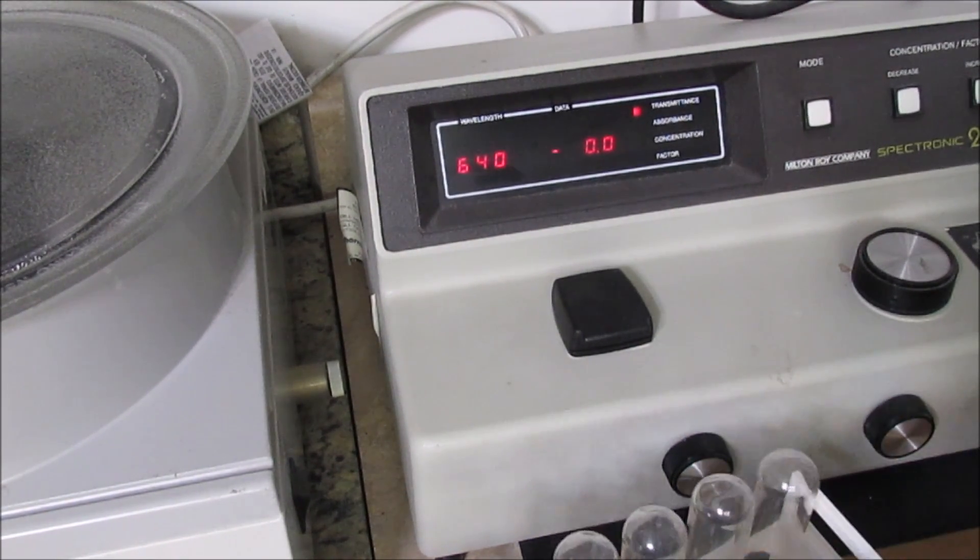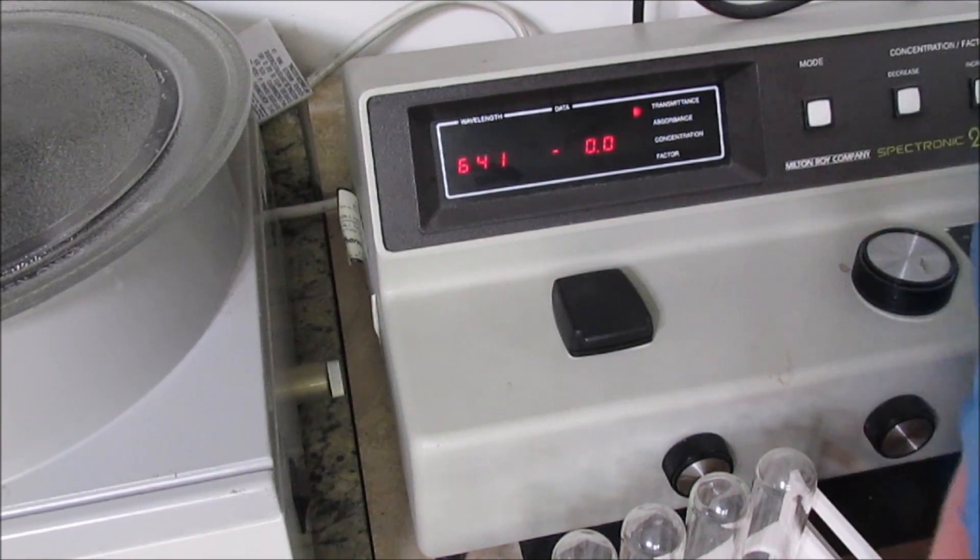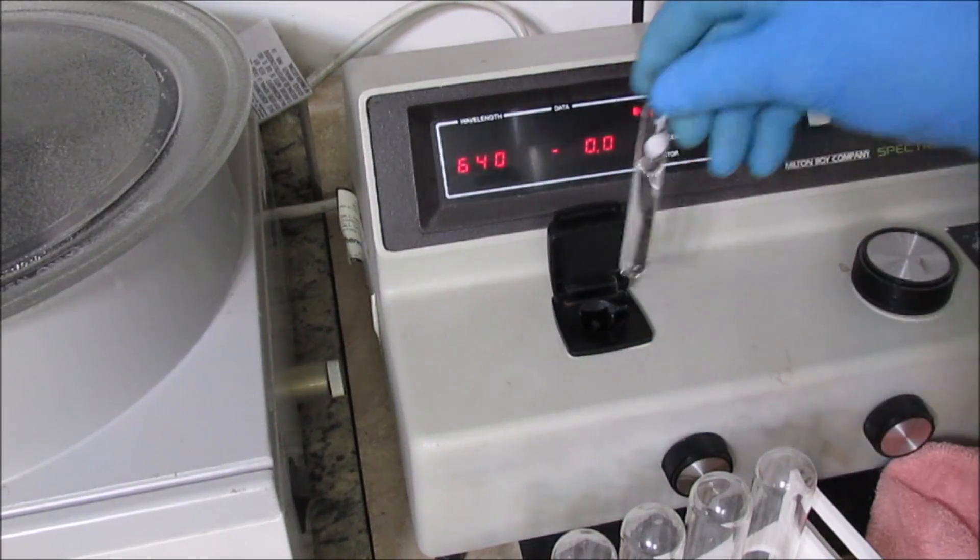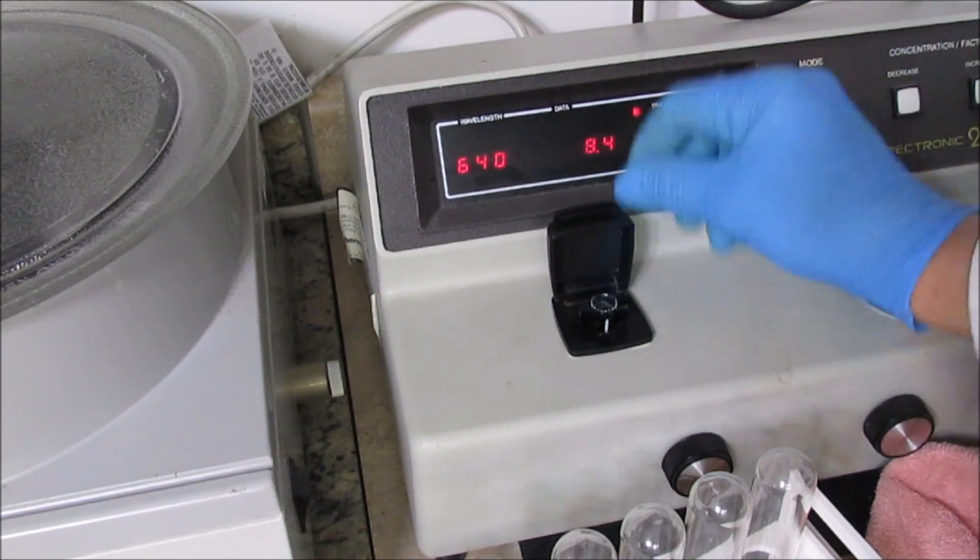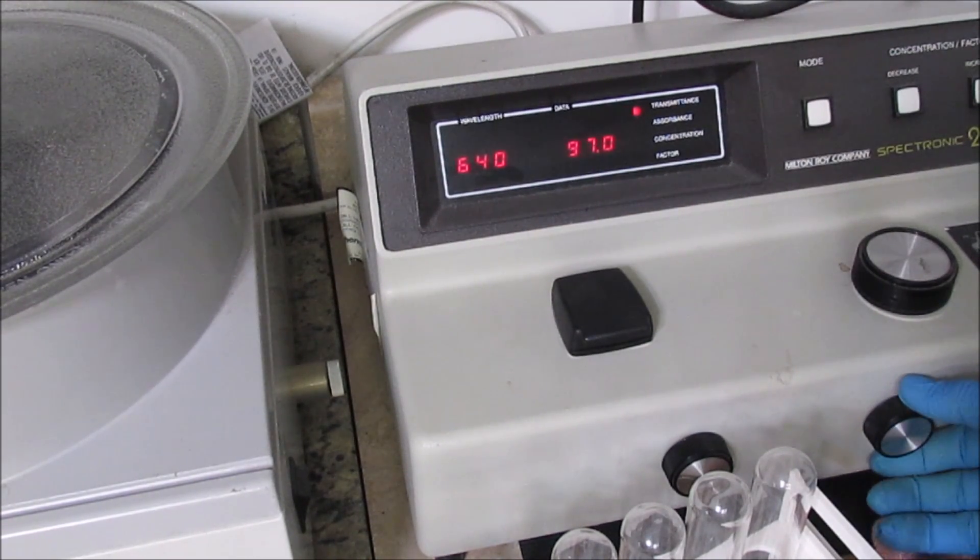Alright, now I take my blank sample and wipe it off real good, and insert it into the cavity here. Then I use this knob over here to adjust a full scale deflection up to 100.